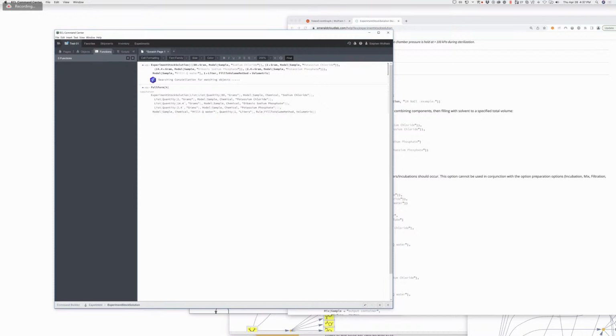So what's happening here? Right now, it has to simulate the entirety of what happens in the laboratory to make sure this is all going to be okay. It may come up with a bunch of complaints or realize that it has to get some resources you don't have access to. It's checking all the equipment to make sure you're not going to melt it down while you're doing these things. It's making sure that those amounts that you're going to weigh out are going to work out with whatever measuring devices have to be figured out. And then it will come back to you with a protocol description.